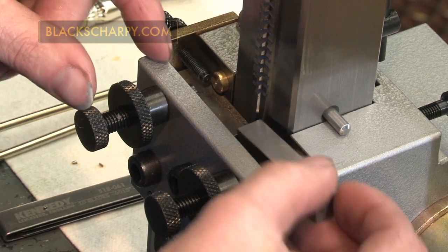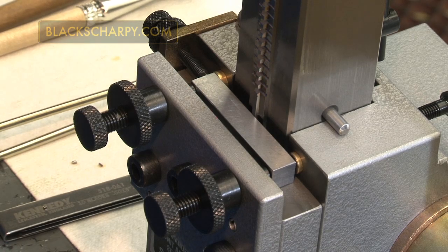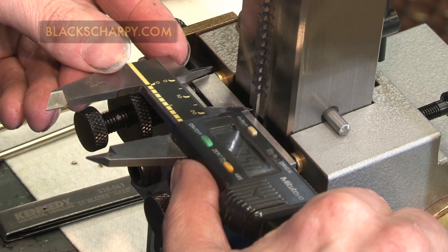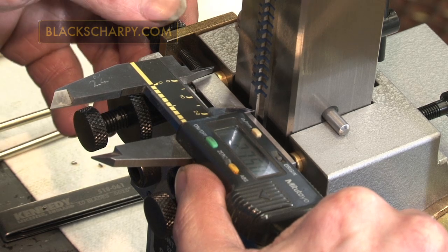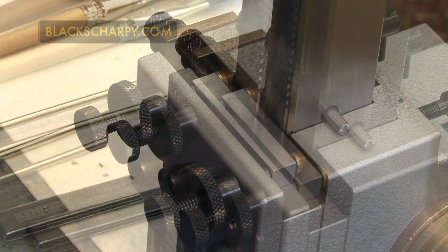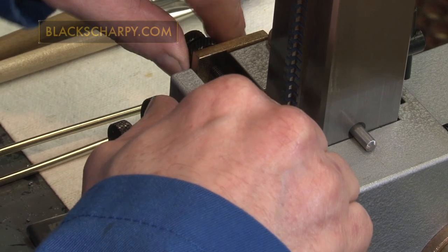When setting the axial position, load a 10mm square specimen into the machine and move the adjusting screw so that the broach V is in the correct axial position for the standard being produced. Secure the adjusting screw in position by tightening the lock nut.